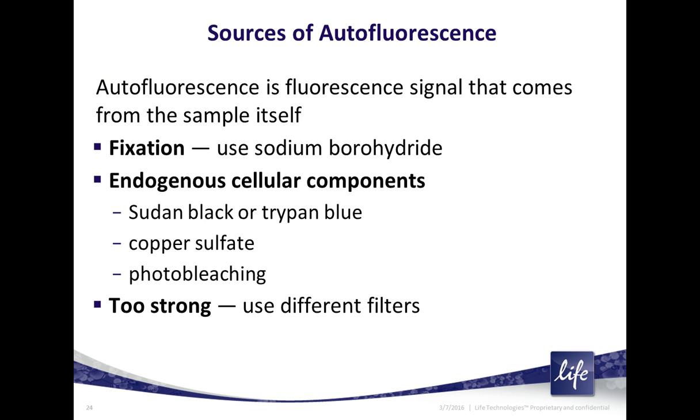Now, I mentioned autofluorescence earlier. That's the endogenous fluorescence of your sample. Plant samples, for instance, have a very high autofluorescence due to, for instance, chlorophyll. Old brain tissue, especially from older mice or humans or whatever age the organism was, can build up lipofuscin, which is a protein that autofluoresces. Autofluorescence can come from overfixation, especially with glutaraldehyde, and tissues have much higher autofluorescence.